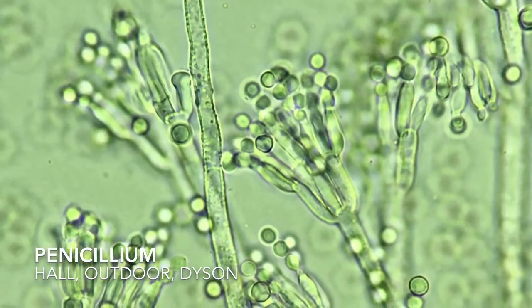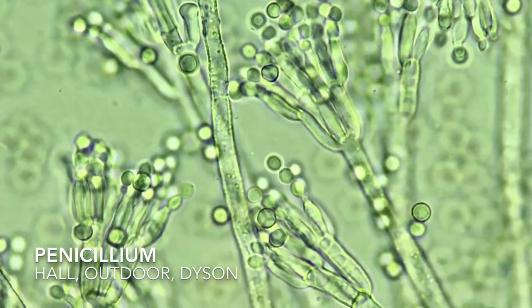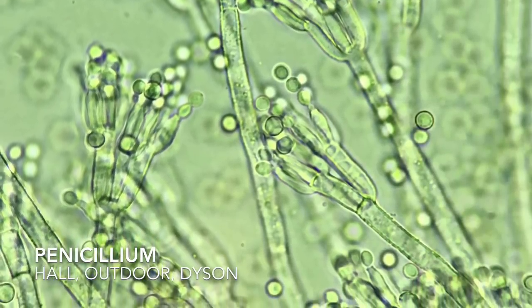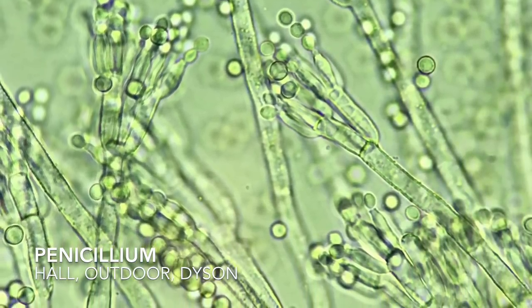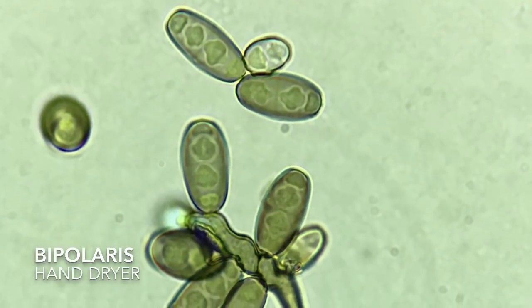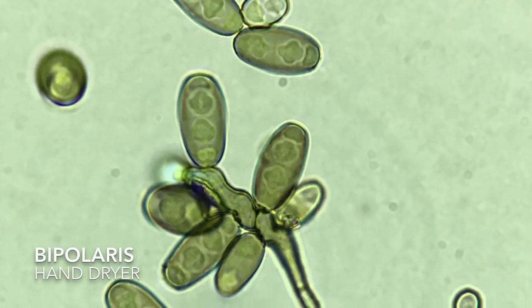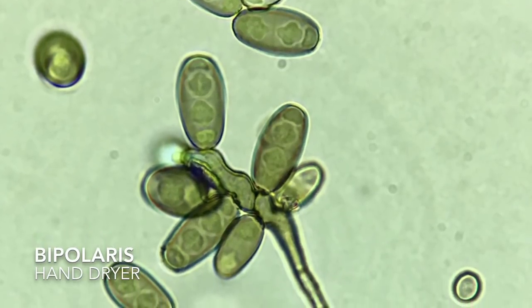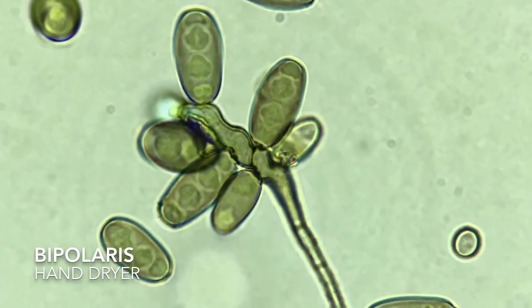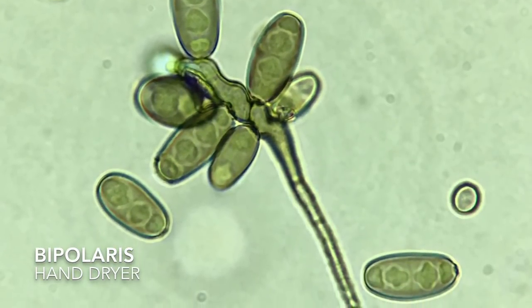Of course, we have Penicillium, the cosmopolitan fungus that can be found virtually anywhere. It's just as happy in the outdoor environment on dead vegetation as it is on the foodstuffs that you've kept a little too long in the fridge. On the classic hand dryer sample, we found Bipolaris, which is not unexpected. The hand dryer was near a park, and Bipolaris is a known pathogen of grasses. It's also a facultative decomposer, so it can go both ways — common in areas that have grass.